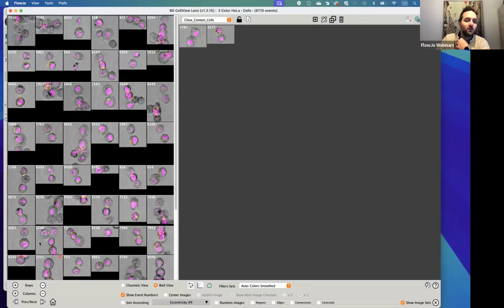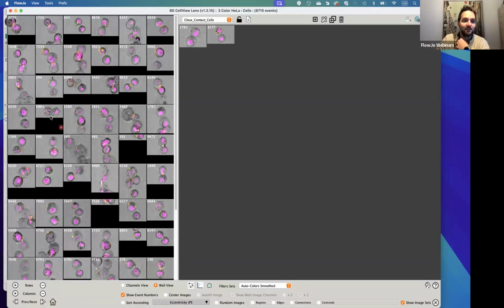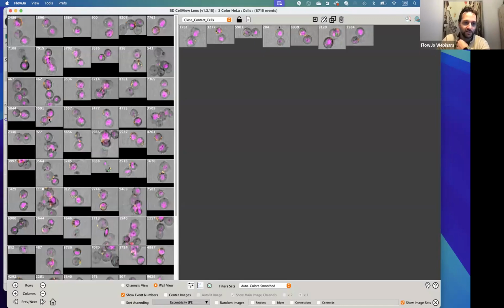Of course, the more you select, the better, certainly, because it has more to compare with. Okay, this one looks contact. So of course, this is a bit of a manual part. I need to manually click on the morphology if I'm interested.